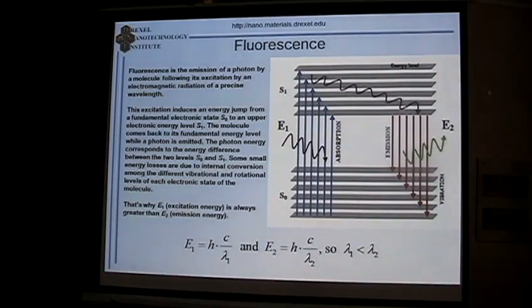You all know that fluorescence is just an emission of photons by molecules when you excite them to a next electronic level. This is a problem for Raman spectroscopy. However, as we will talk later today, fluorescence of carbon nanotubes can also be used for identification of nanotubes. Moreover, this is the only way to really exactly and uniquely determine Hamada indices of carbon nanotubes. So, if you do Raman spectroscopy, this is a problem.